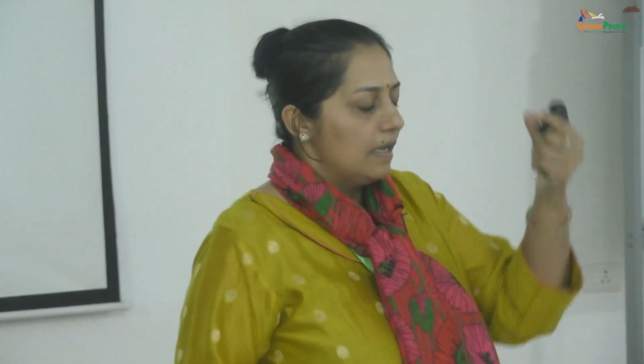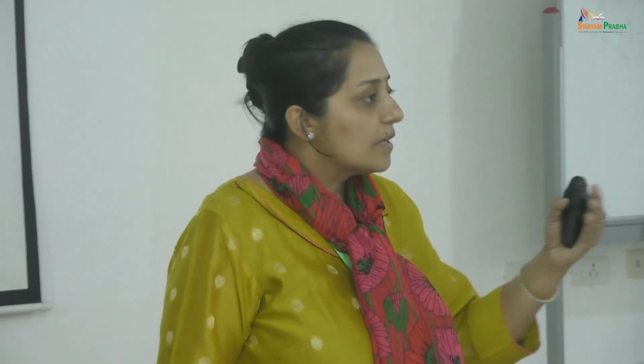The root morphology of Azadirachta indica became similar to that of Linum album. The minute the number of branches increased, the taproot size decreased, and they started growing in suspension. The mucilage formation and the mass transfer limitations indeed were the key. So that helped. You need to understand your culture requirements, because everything is not directly extrapolated.